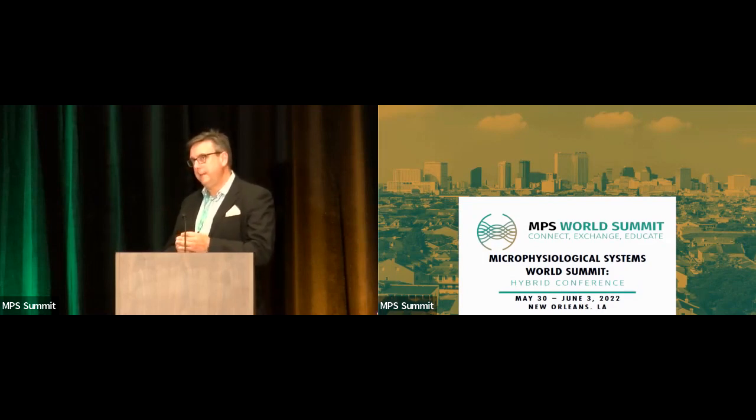I think our primary interest here is building a system that allows us to run a screen to find compounds against the disease in an efficient way. So we've decided not to add these extra layers of complexity to the system. But from a scientific perspective, I totally see the point.